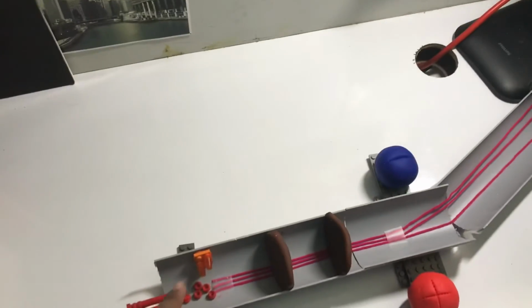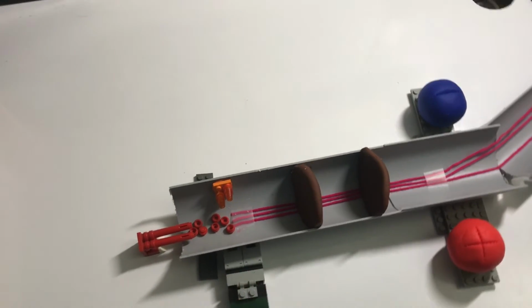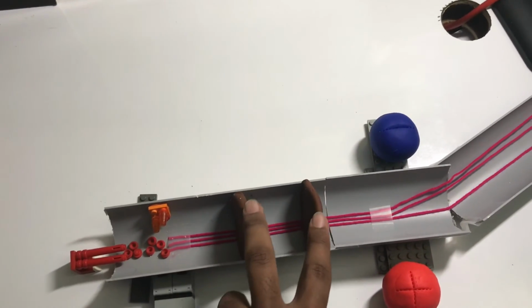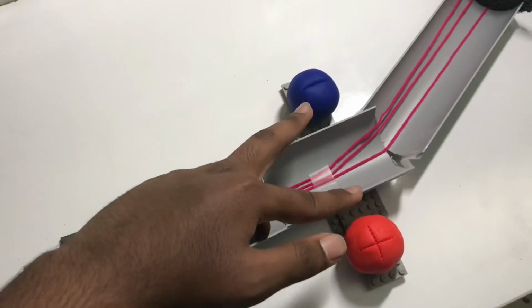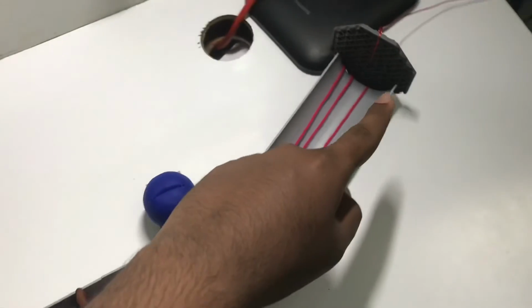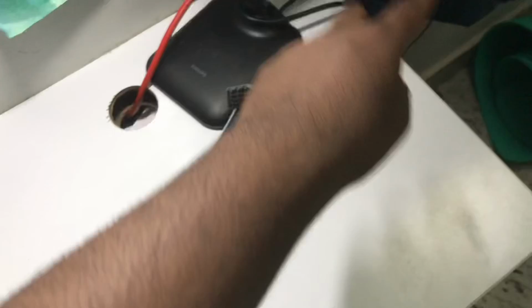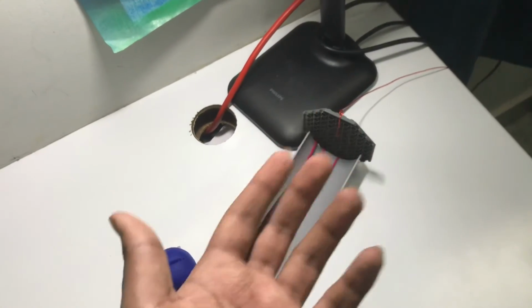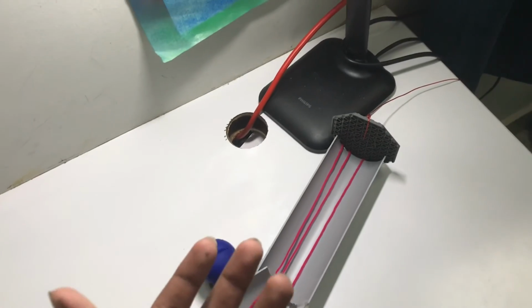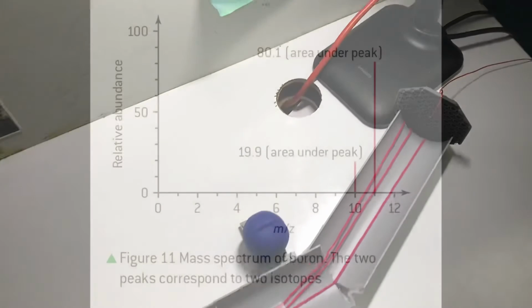contraption. So, to summarize, it starts with vaporization, and then goes on to ionization, then to acceleration because opposites attract, then deflection because of the magnets, and then lastly to the detection, which is the last phase. Detection then goes to the computer, which processes the data and gives us the desired outcome. And I will show you what a sample outcome might be in the next section.